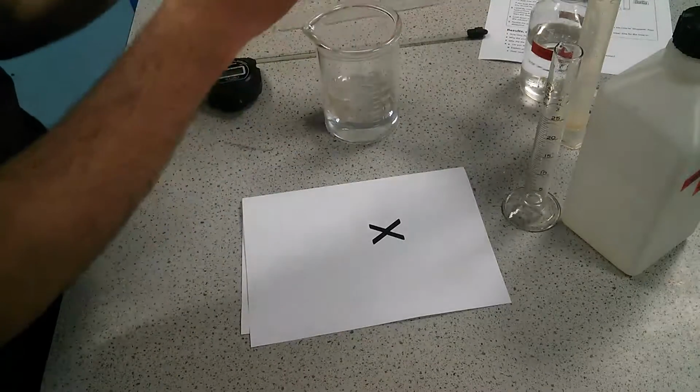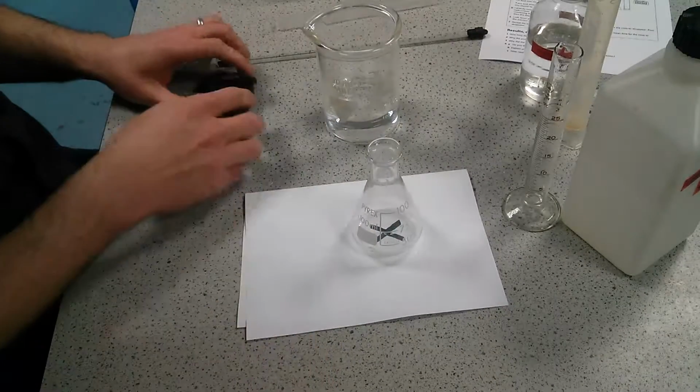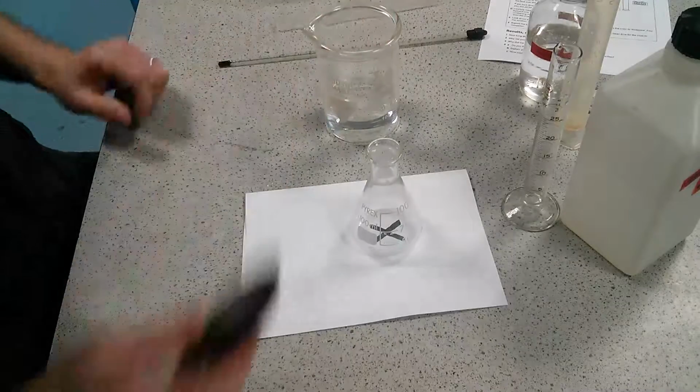And then take it out, put it on the cross, add your acid, and then you start your stopwatch. So you've got start, stop, reset.